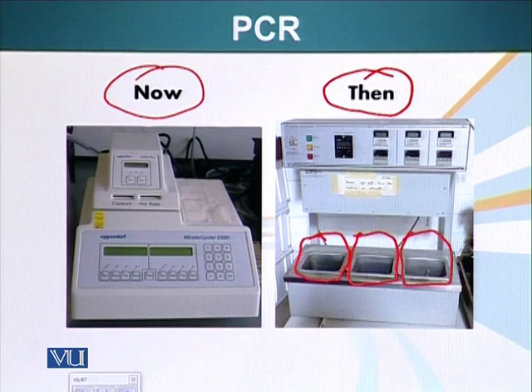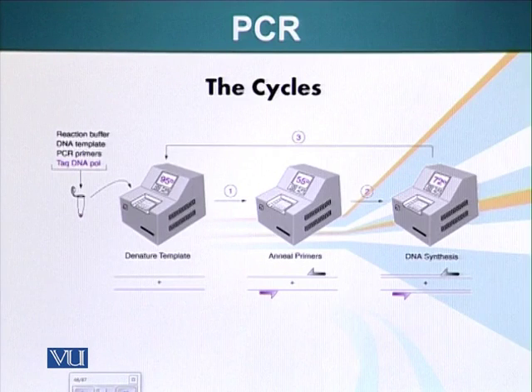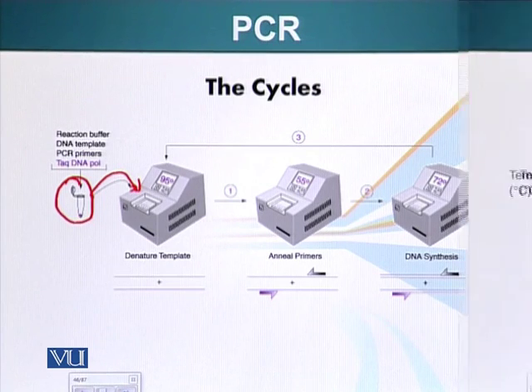I wanted to show you how this procedure was done initially. So here are the 3 cycles again: 95, 55, and 72. The reaction tube is placed in the machine. This machine has space, wells in which this tube can be placed, and then the machine is programmed what temperatures we want for how long of a duration. Then this reaction is allowed to carry out. Once the reaction is complete, say the 30 cycles have been completed, the tube is taken for further analysis.